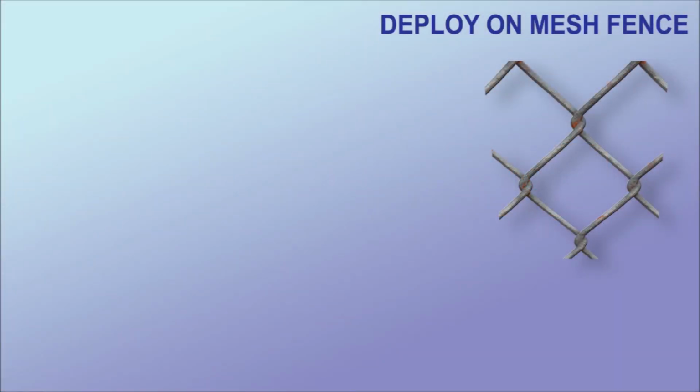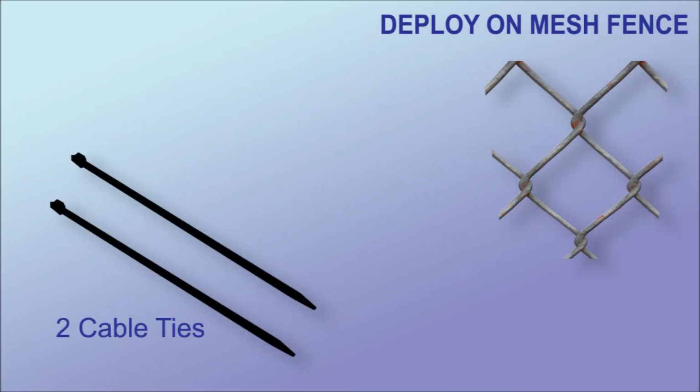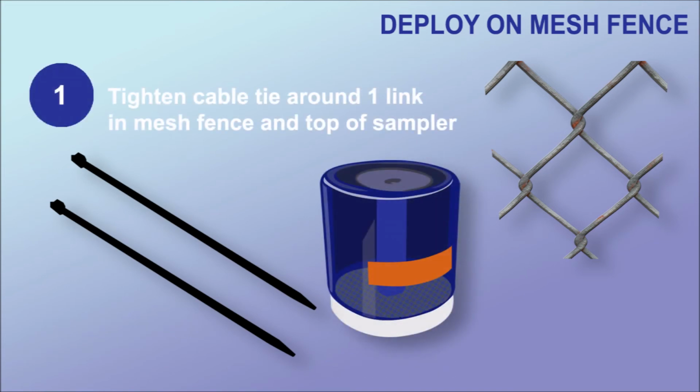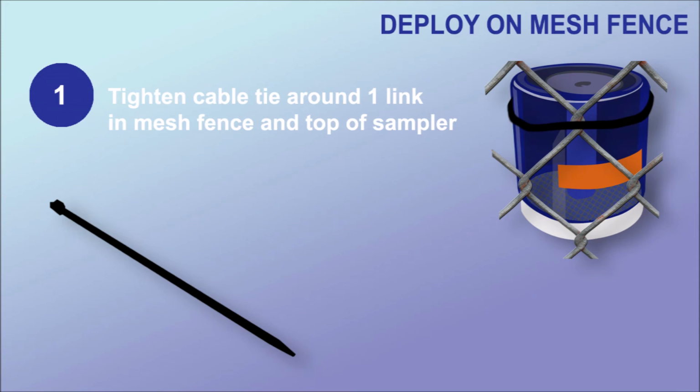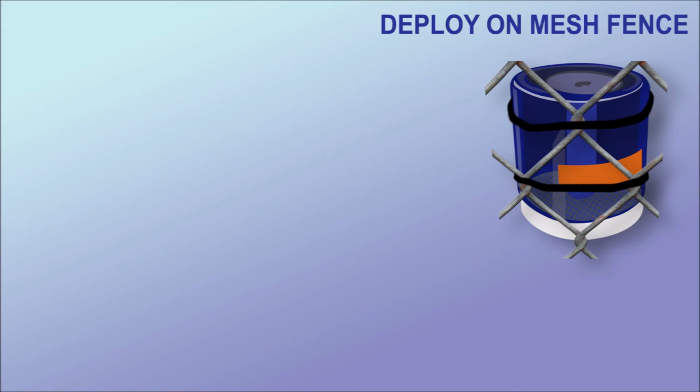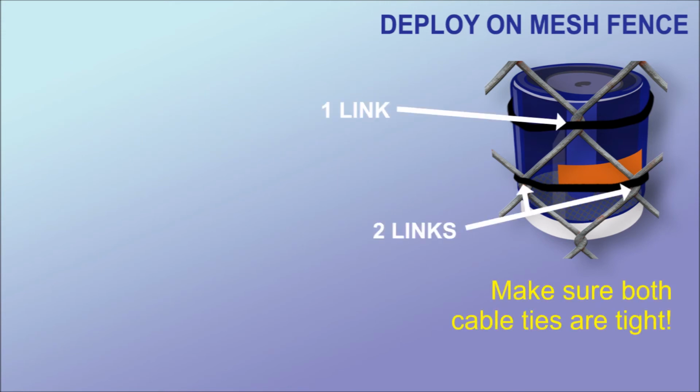To deploy the sampler on a mesh fence, you will need two cable ties and a sampler. First, tighten the cable tie around one link in the mesh fence and the top of the sampler. Next, tighten the cable tie around two links in the mesh fence and the bottom of the sampler, parallel to the ground. Finally, make sure both cable ties are tight so the sampler does not move under strong winds. Take note of the date and time.